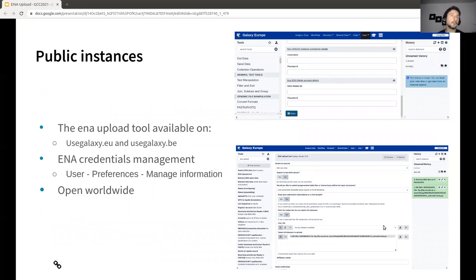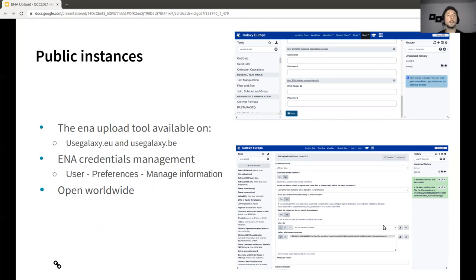The third option is using the public Galaxy instances. This is a public tool, so it's already available in several instances, for example usegalaxy.eu and usegalaxy.be. In this case, anyone can register and upload data. You need to fill in your ENA credentials that you get from the ENA website in your user preferences, and the submission is done using those specific credentials.